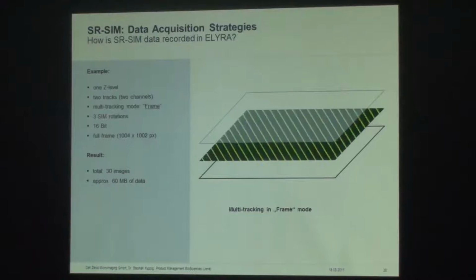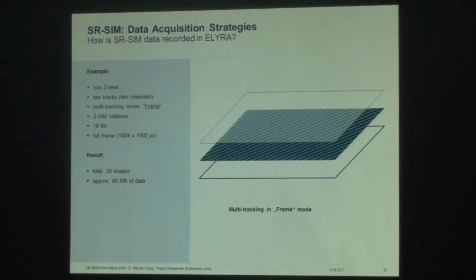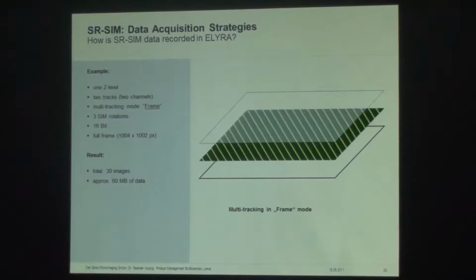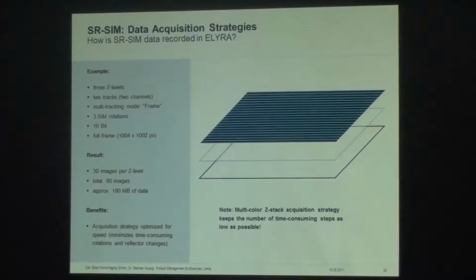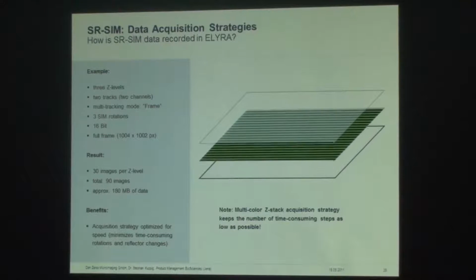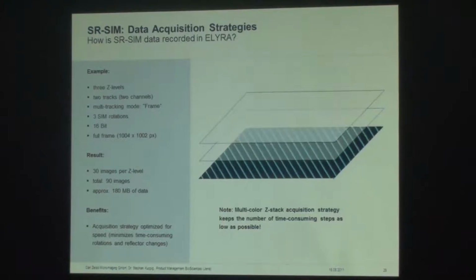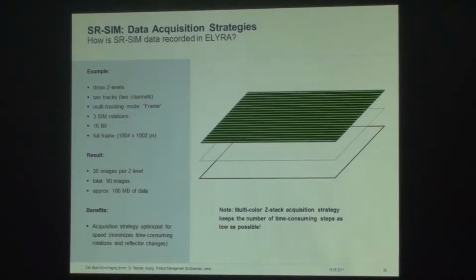And this is for multi-tracking with a multi-channel. Before you saw just a single channel. In this case, you finish one particular channel, and then you move on to the next channel in all your rotations. Then when you take a Z stack, again you keep the field rotator in the same position and finish the Z stack. It uses a piezo Z, although on top of a motorized Z, we use a piezo to control and move the sample.